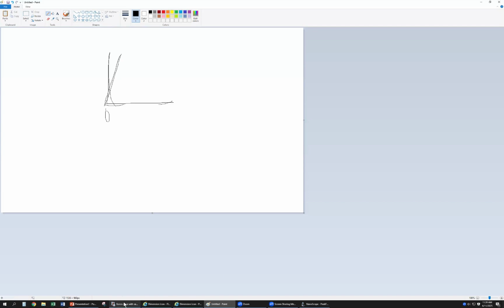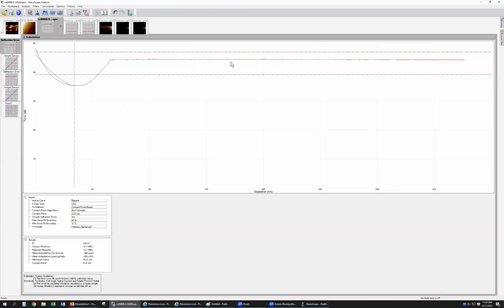Okay, so if you go to your first curve, this one you see is the indentation. We get the separation, right? The deepest point is 0. That means then we get all the indentation depths from here to here. Okay, from here. So how do you calculate the indentation depth from this baseline? This one is the baseline, right? This one is the baseline, right?